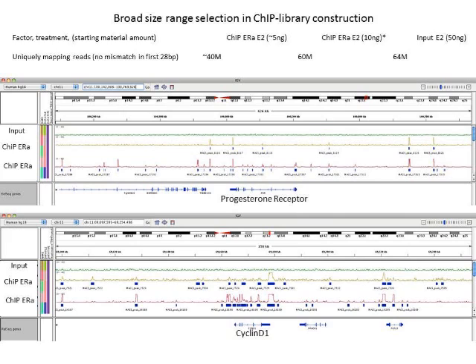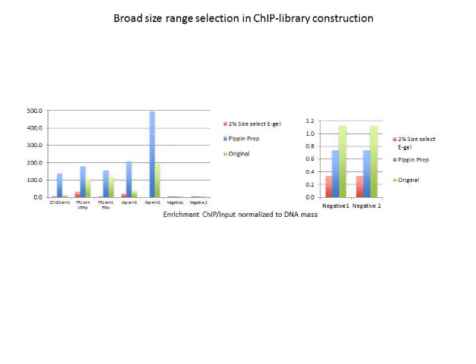Showing that, as usual, when you do qPCR validation after enriching the library, you do see a little bit of higher enrichment of the ready library compared to the original. So the prepared library is the blue, and the original material that is completely unamplified is in green, and then the size-selected eGel of 2% is the red one. So again, based on this one, I would never have gone on to sequence the eGel library, but with the Pippin prep, it worked.